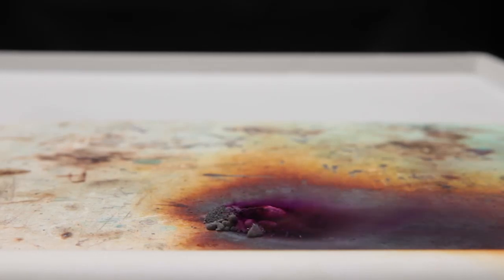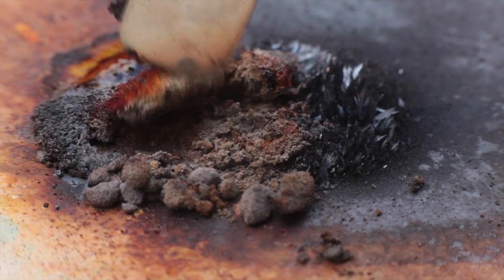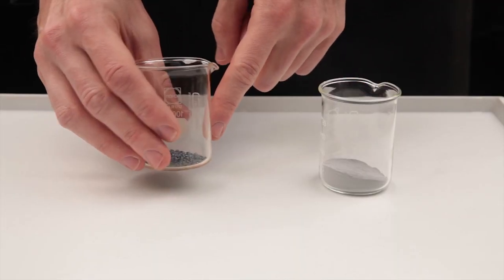In this month's Exhibition Chemistry, we're going to be looking at the reaction of aluminium with iodine, one of a number of demonstrations you could choose to highlight how the properties of a compound differ from those of a mixture of its constituent elements.